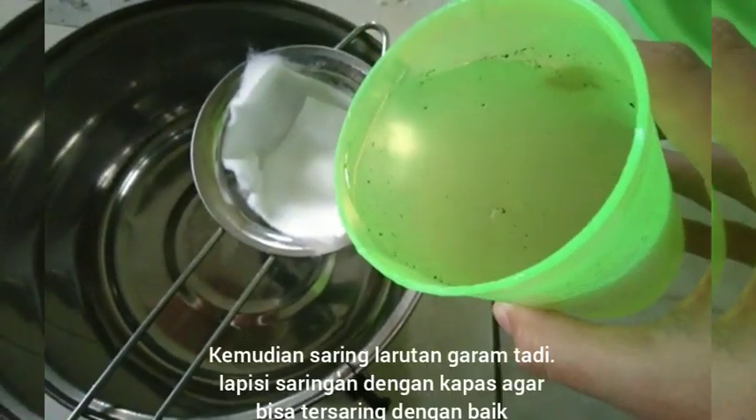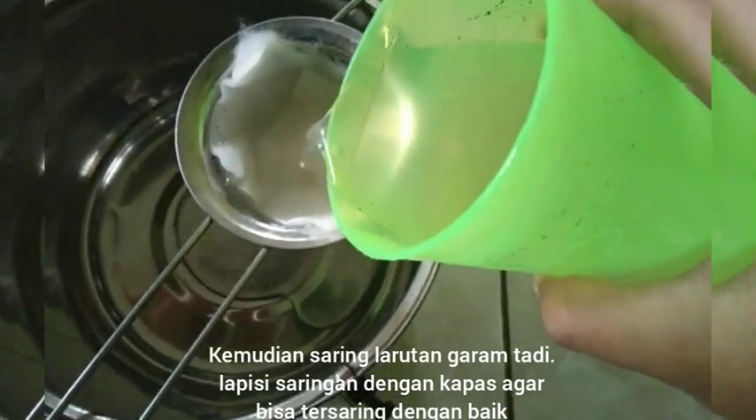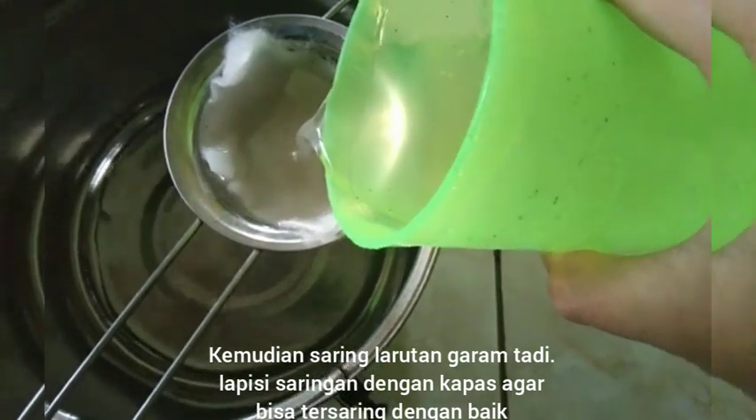After the salt dissolves in water, filter the solution using a filter coated with cotton so that the dirt is filtered out perfectly.